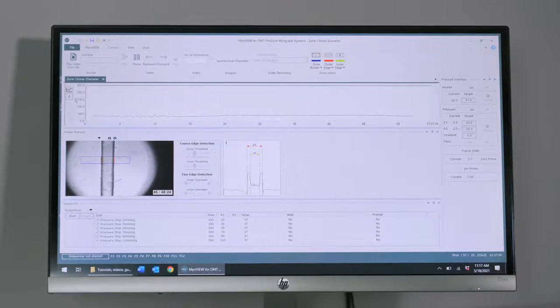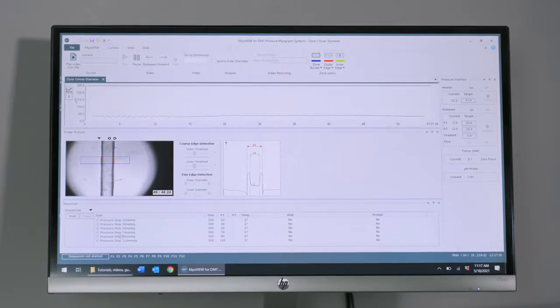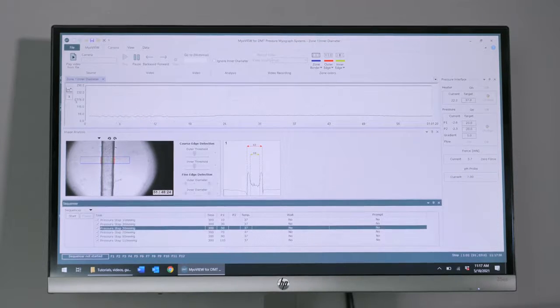You can also use it to run automated pressure protocols, perform data analysis, and record the video throughout your experiment. More in-depth information can be found on the DMT website or by contacting a DMT representative.